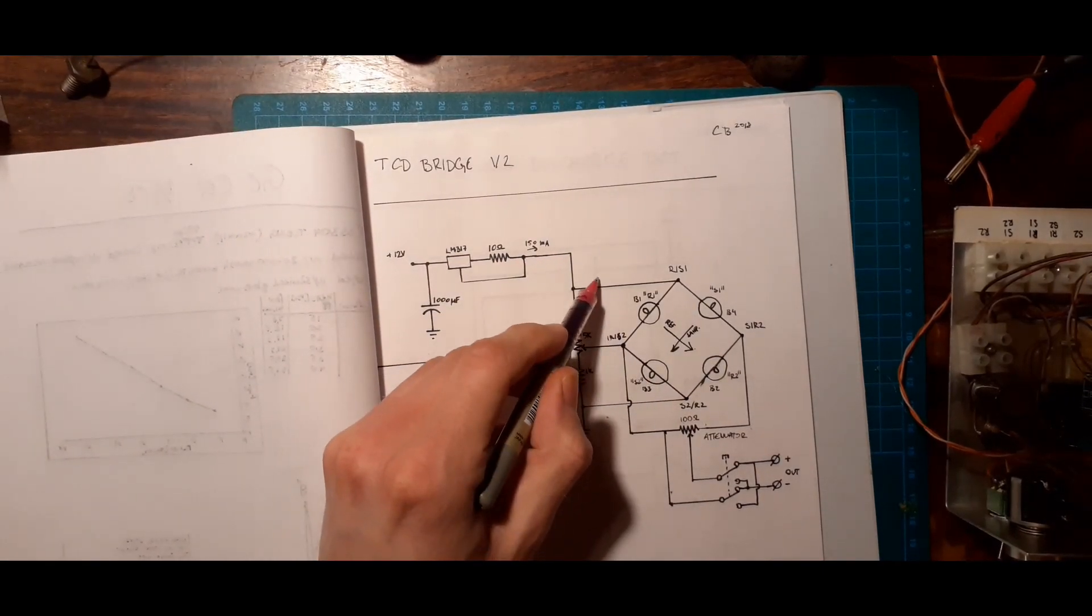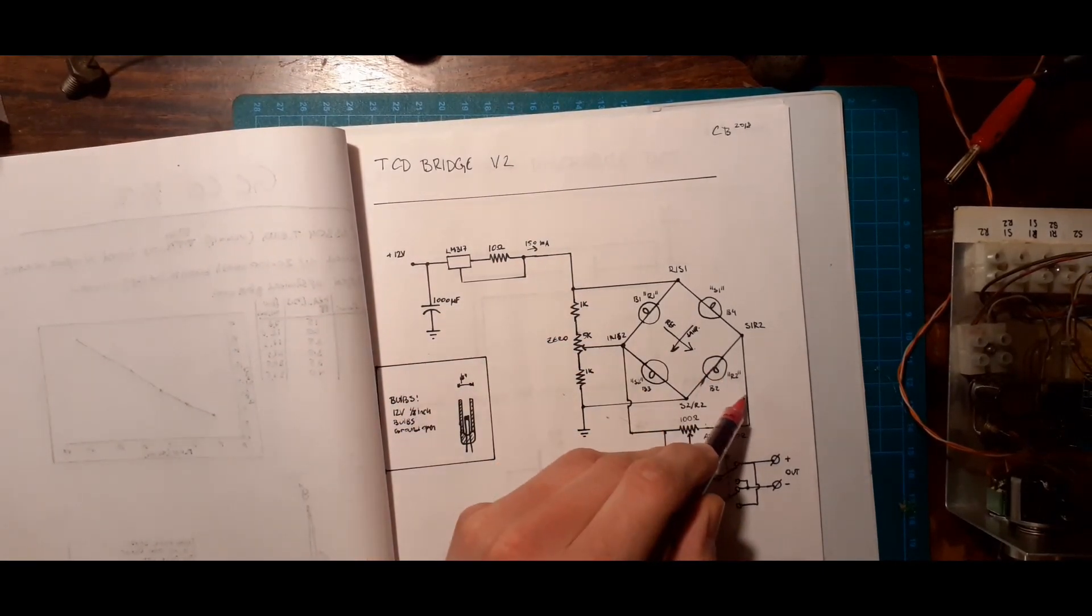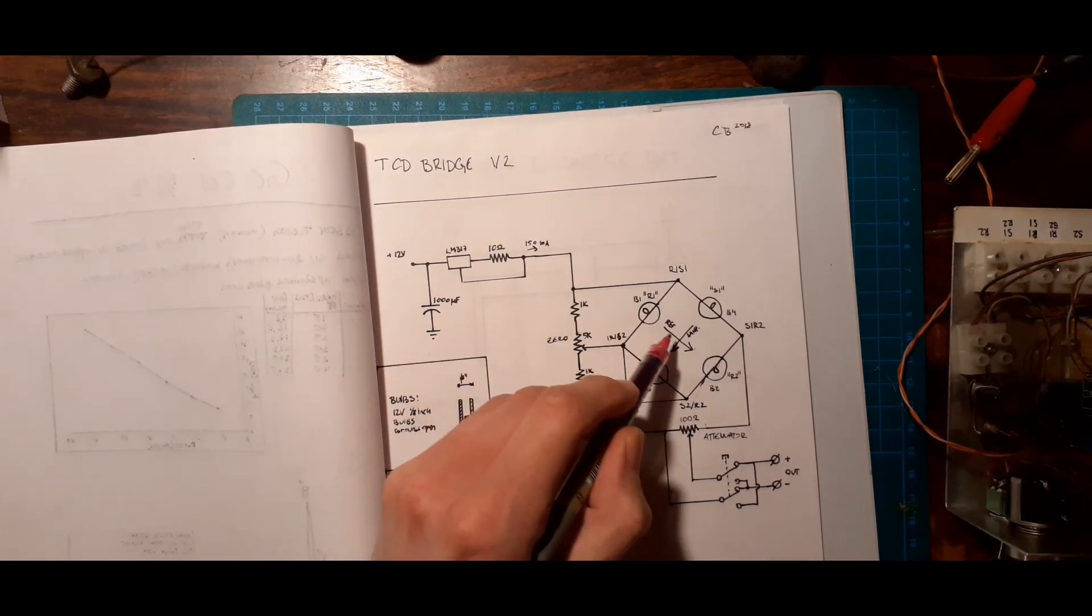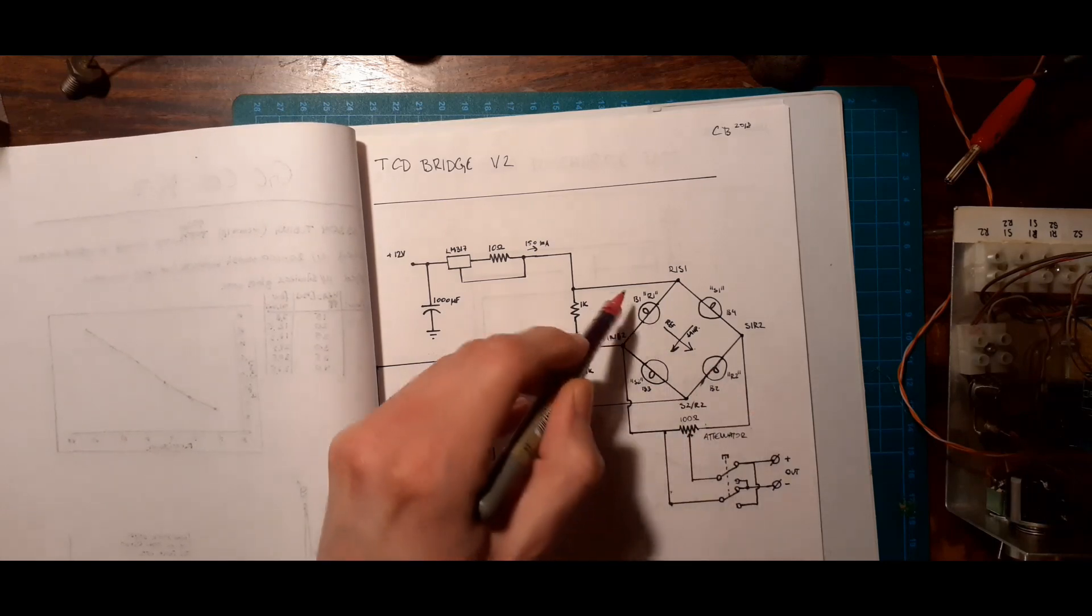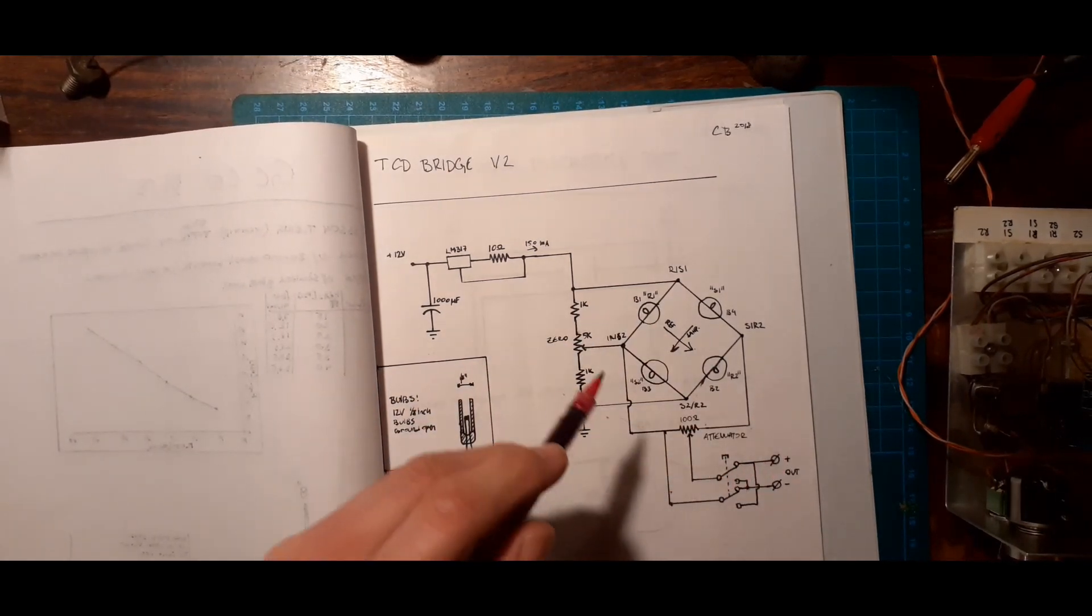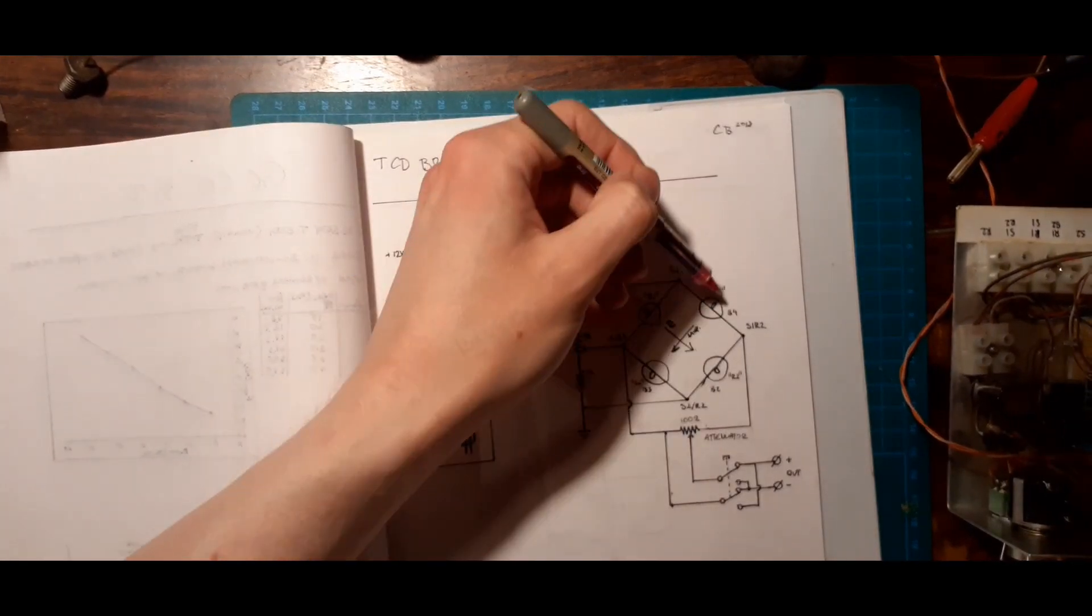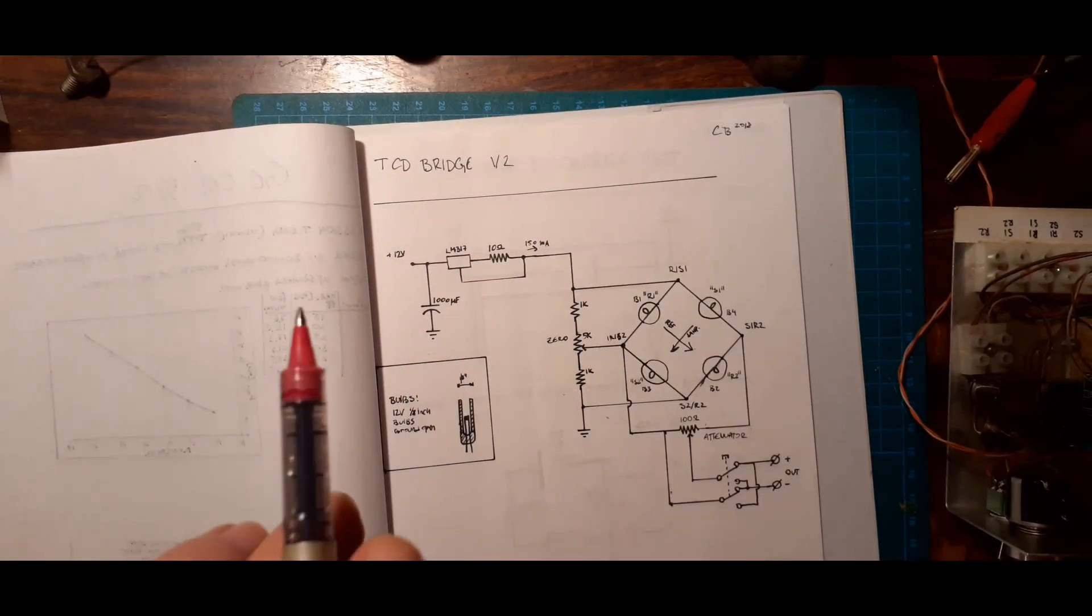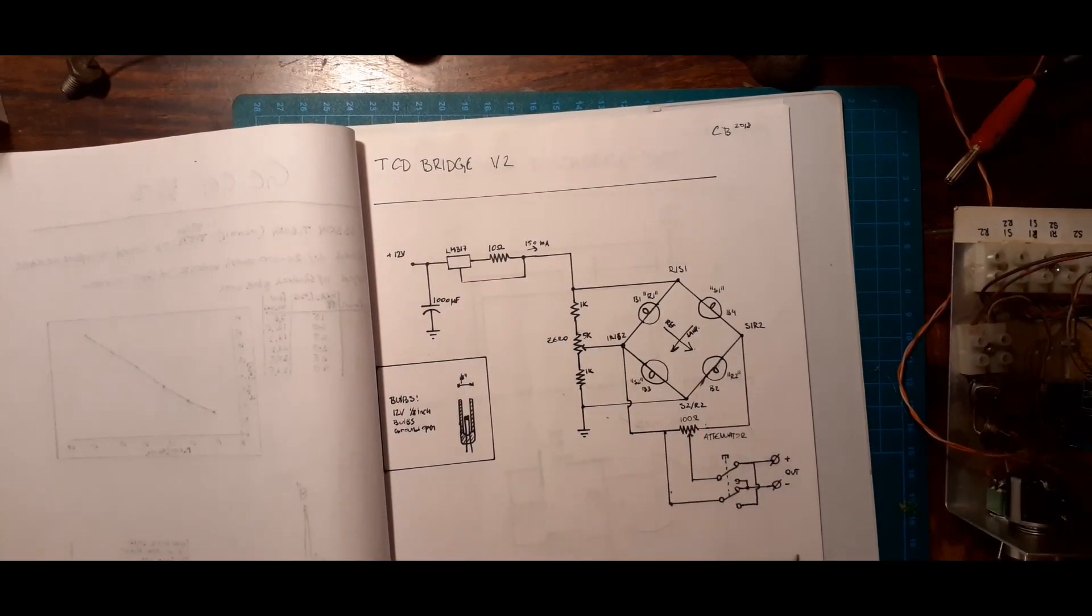What will happen is that there will never be a change in the reference flow. It'll have the same thermal conductivity and wick the same amount of heat off of the filaments at all times, but once an analyte passes over the other two filaments, the amount of heat wicked off will either increase or decrease. It'll usually decrease, since helium is the gas with one of the highest thermal conductivity out there.